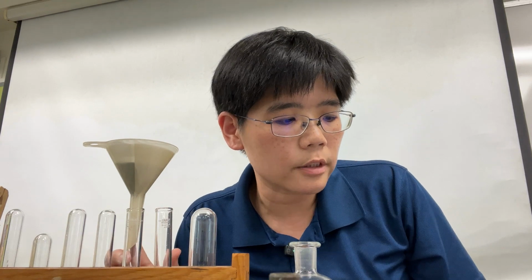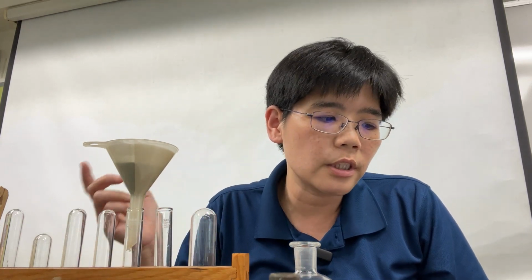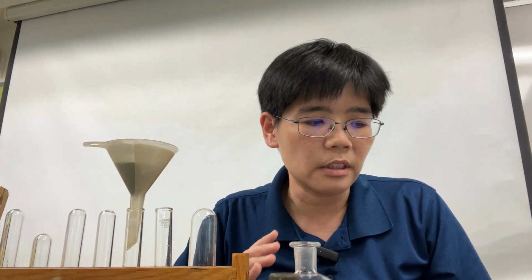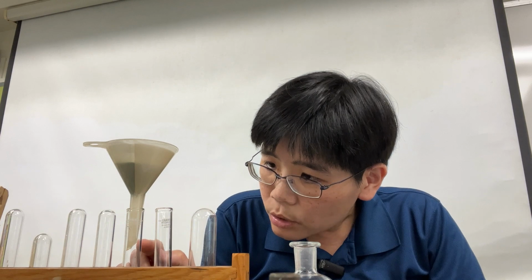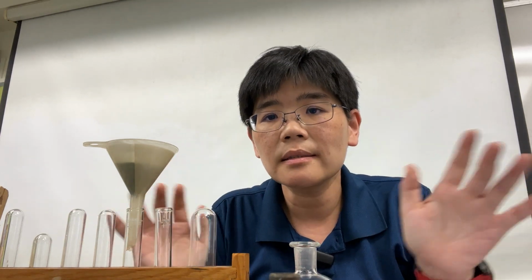Initially, it is likely that a small amount of solid material will pass into the test tube. Once the filtrate is running clear, move the funnel into the test tube containing the acid. So I need to watch out for the clearness, the transparency of the filtrate.